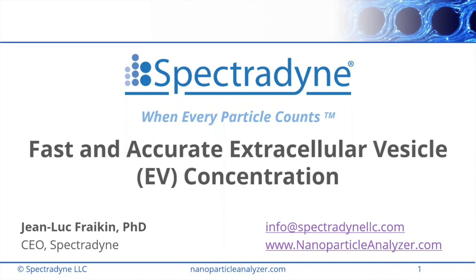I'll lead off with one question for Jean-Luc, which is, there's an increasing interest in the use of microfluidics for studying circulating biomarkers. So in that vein, could you perhaps comment, in light of work by Mehmet Toner and many others looking at circulating tumor cells and such, on the applicability of your platform, the Spectradyne platform, to study different classes of circulating biomarkers?